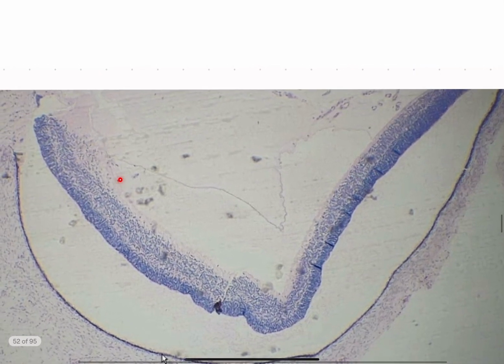So slide name and the structure name of this part of the slide. If we zoom back, it would be something like this, if that makes more sense.